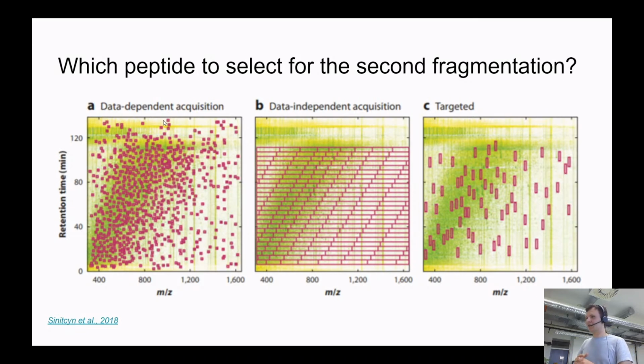And as a result, you don't need to measure all these 10,000 proteins anymore. What's the point of this? Because you know that based on, let's say, 15 proteins, you can nicely distinguish all four groups of breast cancer. So you have 15 proteins, and let's say 60 peptides from all these proteins, because we're using shotgun proteomics. And you know the mass of these 60 peptides, you know approximately the time range when they leave the column, and you can really do targeted proteomics.